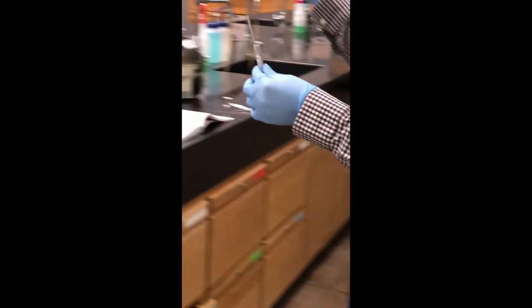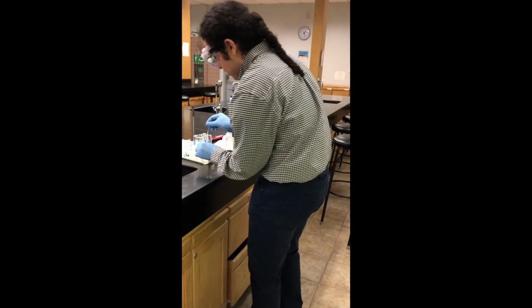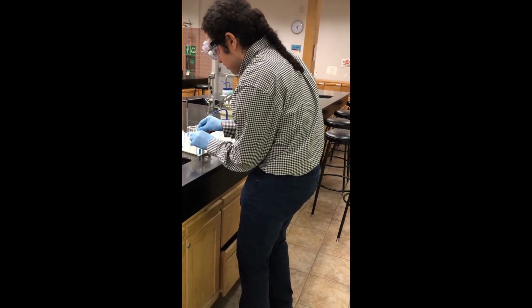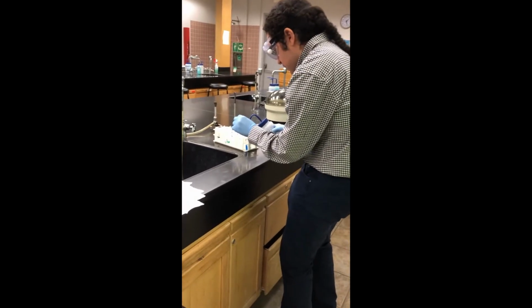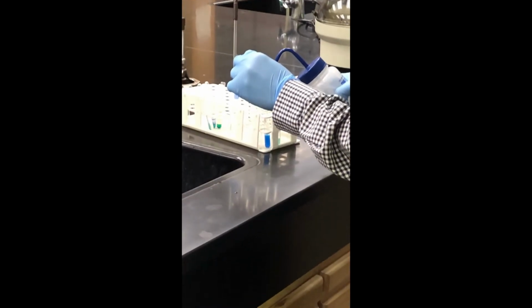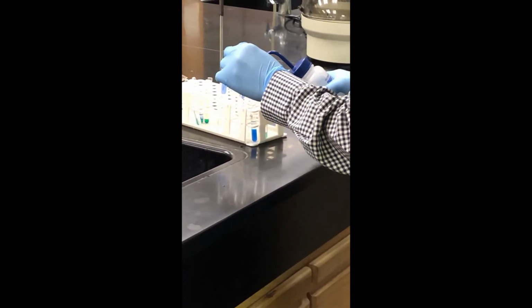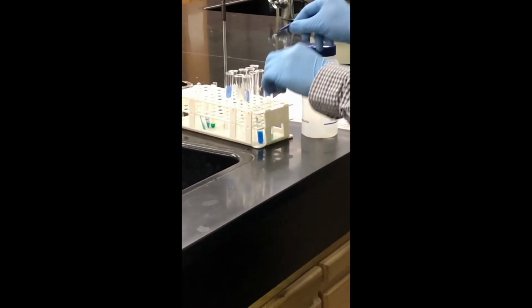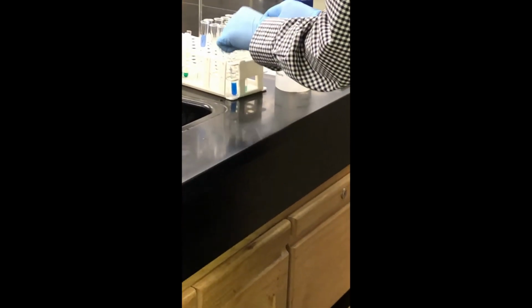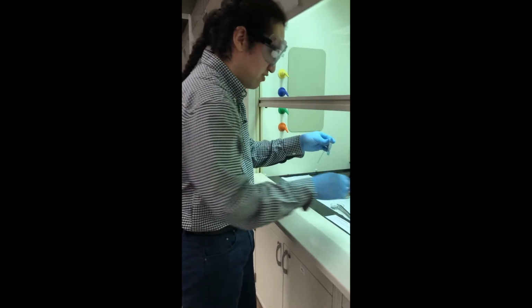We are then going to rinse the contents back into our test tube using a wash bottle, since we want to make sure we're preserving and all of our transfers are quantitative for copper. Okay, we're going to repeat this process for one more sample because we need a balanced centrifuge before we centrifuge.